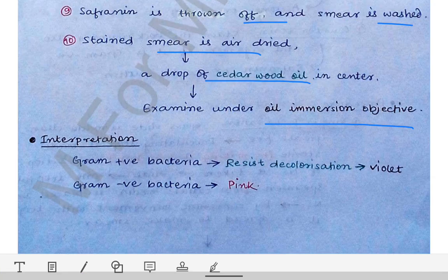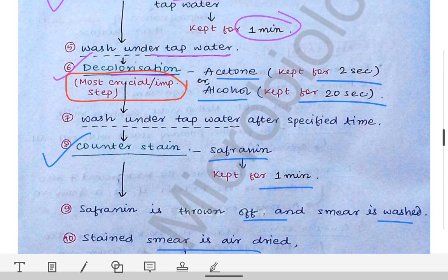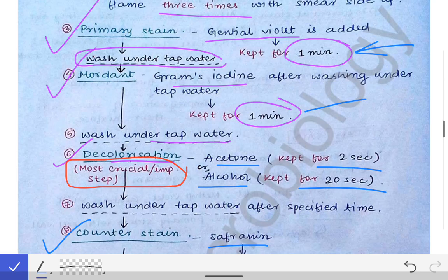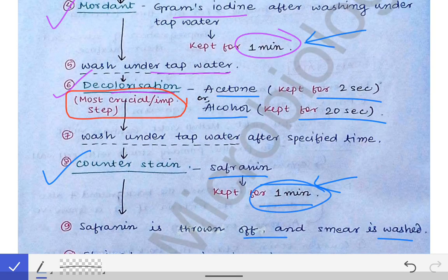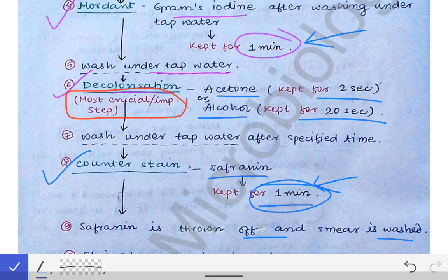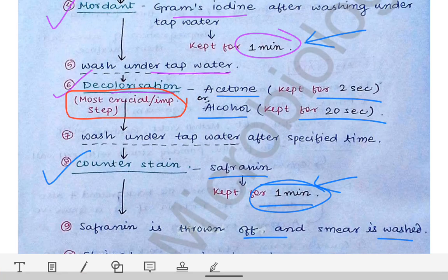There may be some variation in timing across references. In our college, the protocol was: primary stain (gentian violet) for one minute, Gram's iodine for one minute, alcohol for 20 seconds, and safranin for one minute. Various books may have different time durations for these steps, but this is according to the college protocol used here.